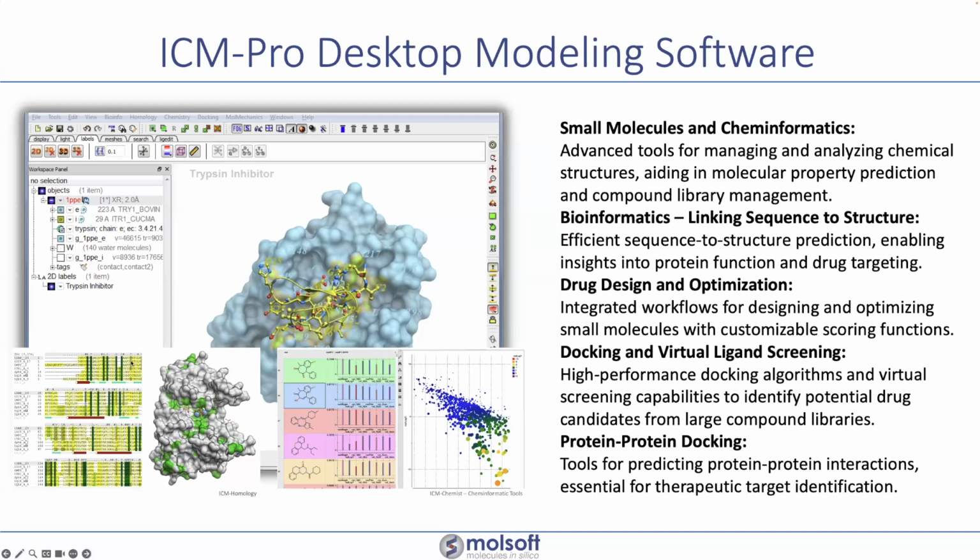There are bioinformatics tools, so you can build alignments and propagate those alignments to the structure. So you can identify where there's maybe similarity between multiple crystal structures and around the pocket, for example, shown here.